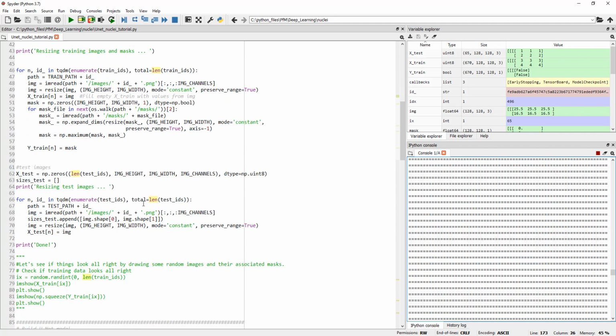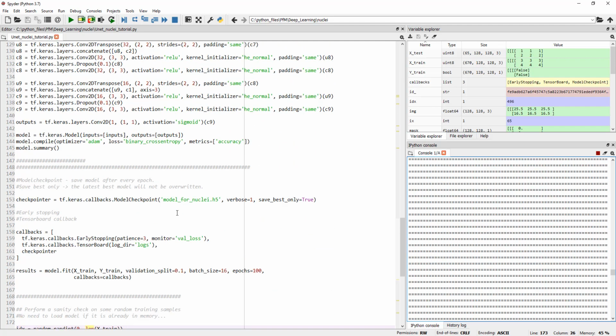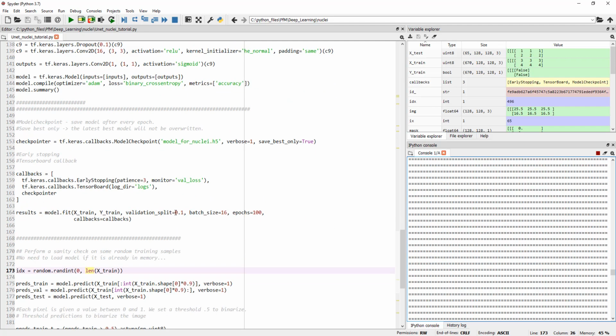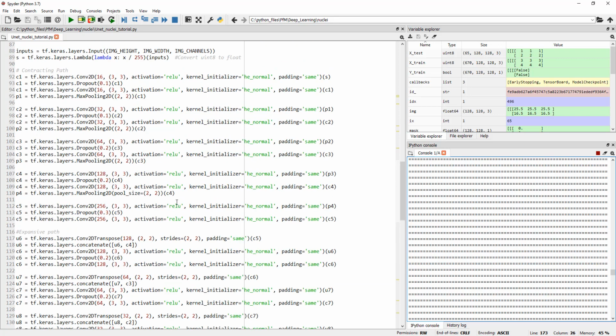Try to figure out how to handle your data. I wish I had my masks all in one image, rather than a whole bunch of images. I have my own way of treating this, but it's up to you how you want to deal with your housekeeping when it comes to handling the files and everything else. Hopefully this provides a good background for you to get started.